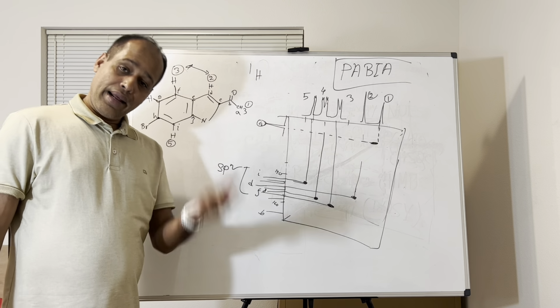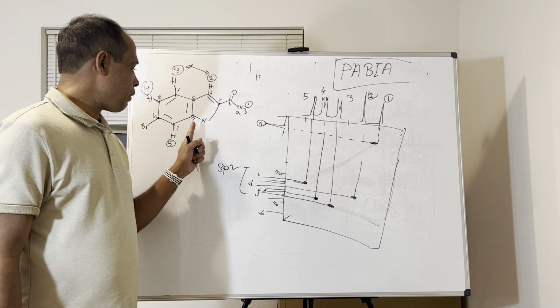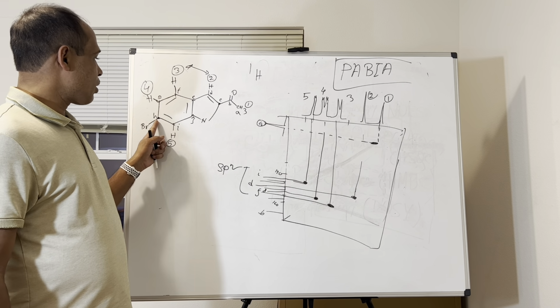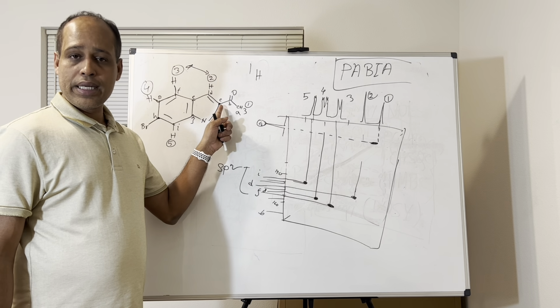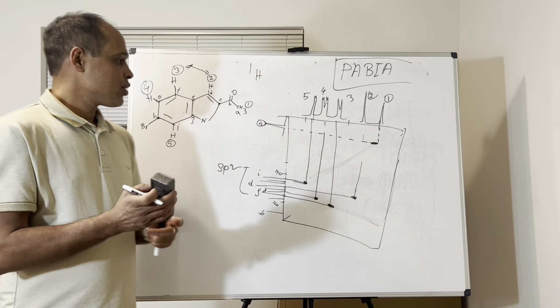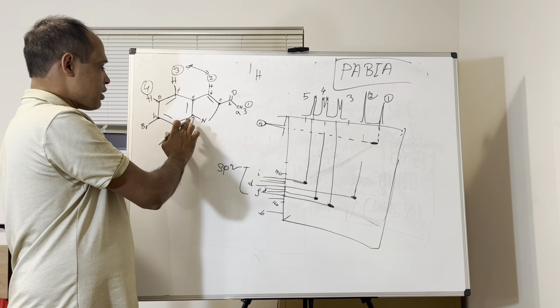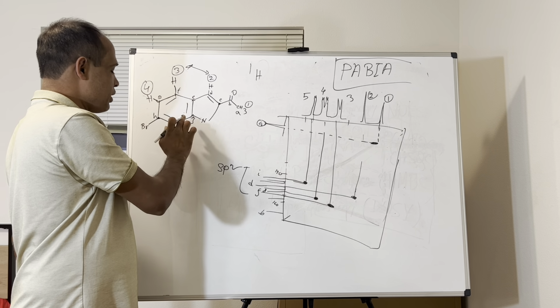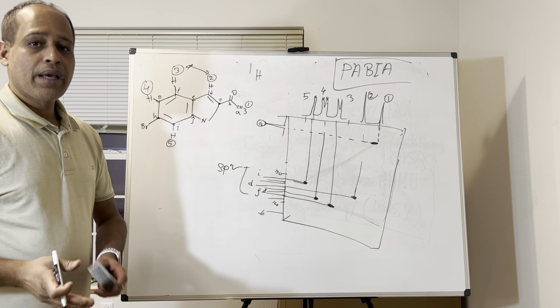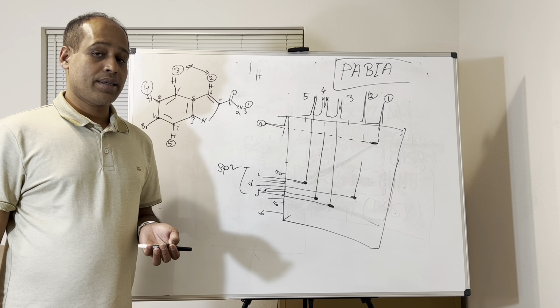Now still you need to know the position of those carbons. If we want to know which one is the Z carbon, which one is the H carbon, which one is the C carbon, right? Because still we need to put the things together, like a puzzle. So now you get some idea, a kind of skeleton structure, but still J could be these, H could be these. You can swap the position of J or H or E, right? So that will help you by the HMBC.